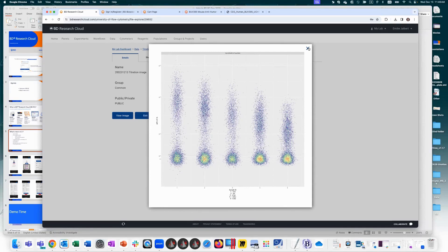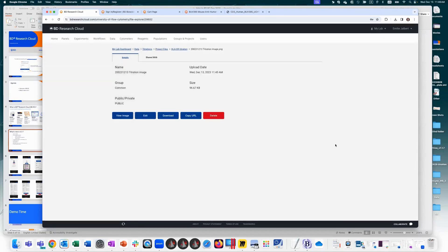This is an example of a microservice in BDRC — by uploading data to the cloud, we can perform automated actions on it. BDRC is in active development and we're constantly adding features. If there's something specific you'd like to see that adds value or saves time, please reach out. The objective is to make your life easier and streamline flow-related analysis and workflows.